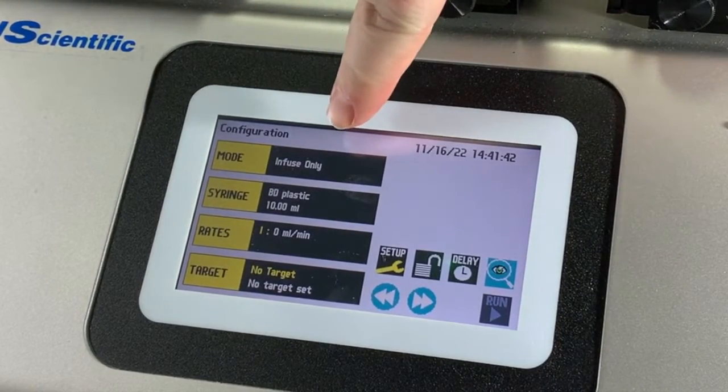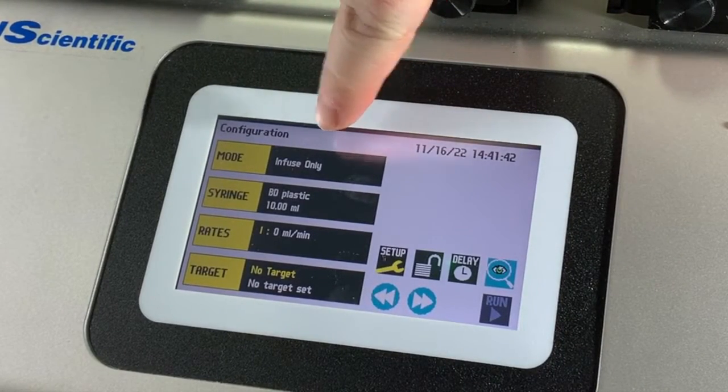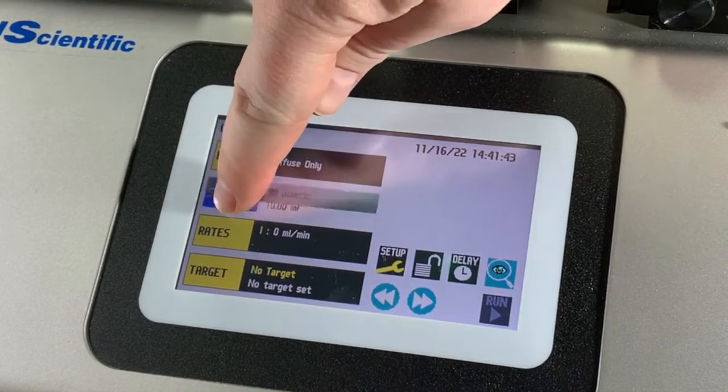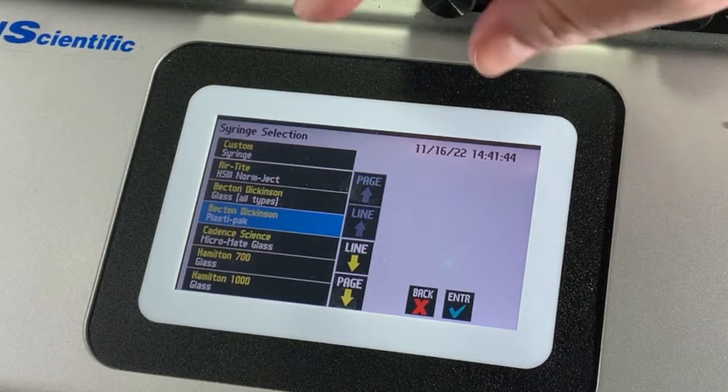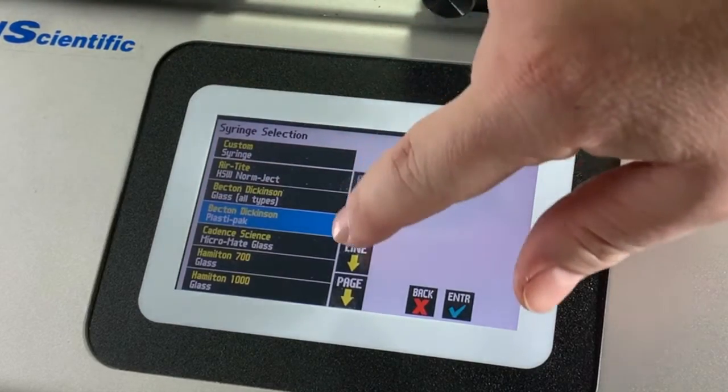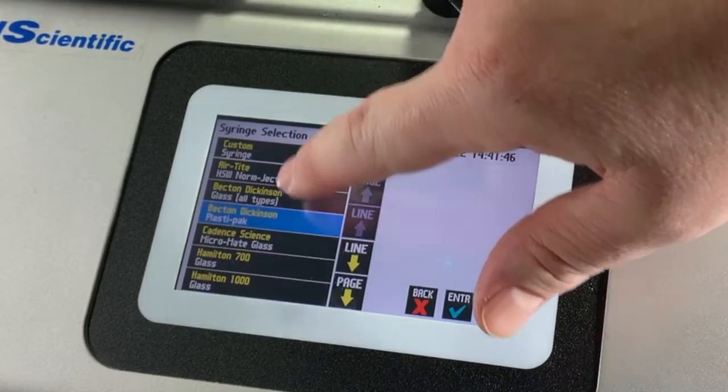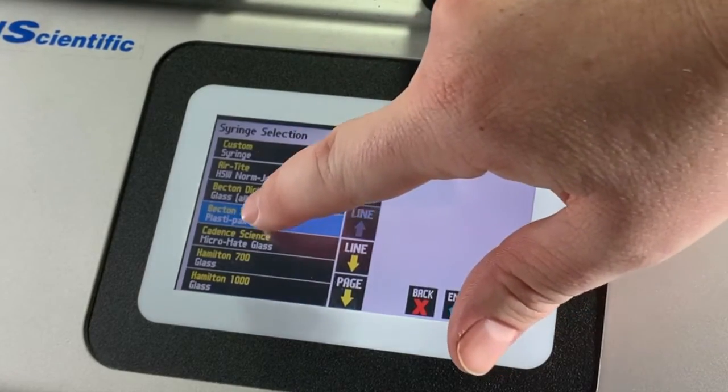Each pump comes preloaded with a syringe menu of commonly available syringes. In this example we're using a plastic BD syringe of 10 mLs volume.